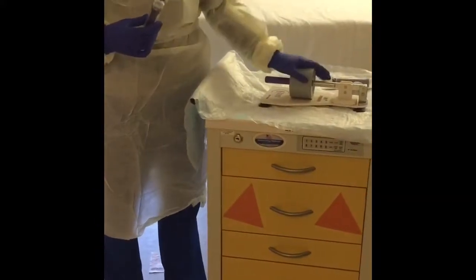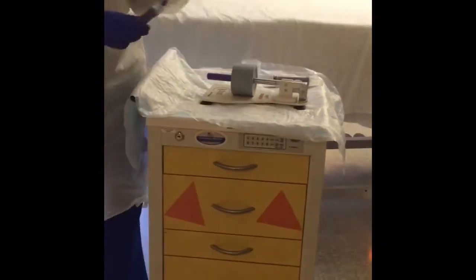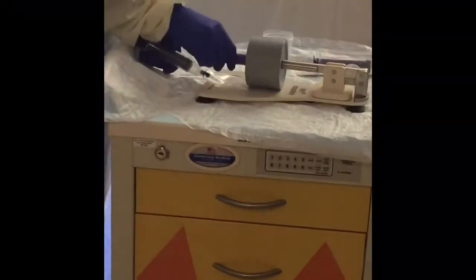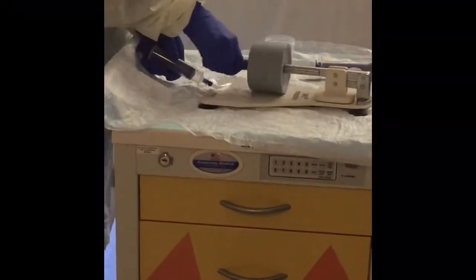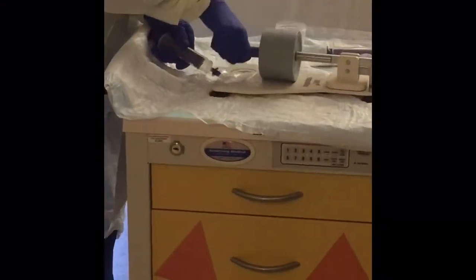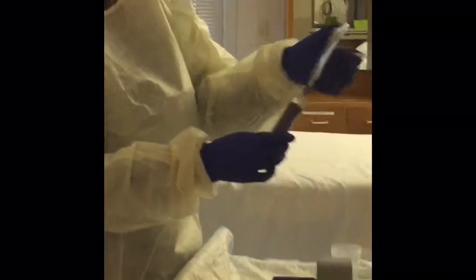With the RX Crush, this is considered the pill roller, and this is the crush plate. So I'm going to put that zip and seal end under the pill roller, and I'm just going to roll over it to make sure it's fully sealed. So you don't want to risk having an exposure. Okay, so that's pretty good. That feels pretty well sealed.